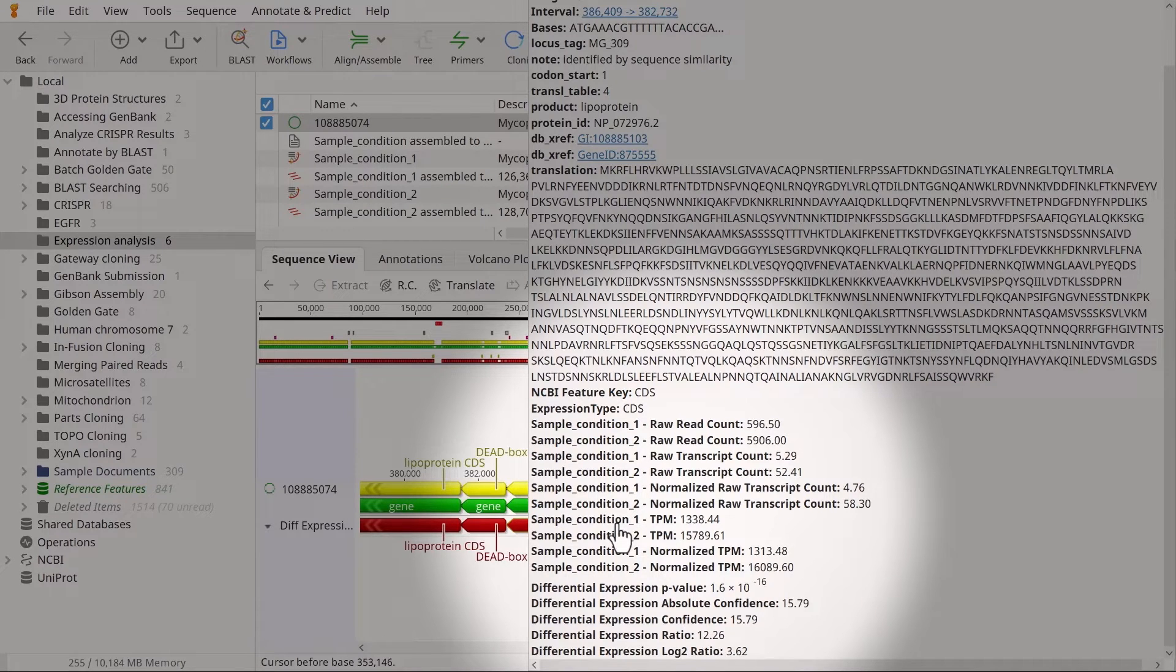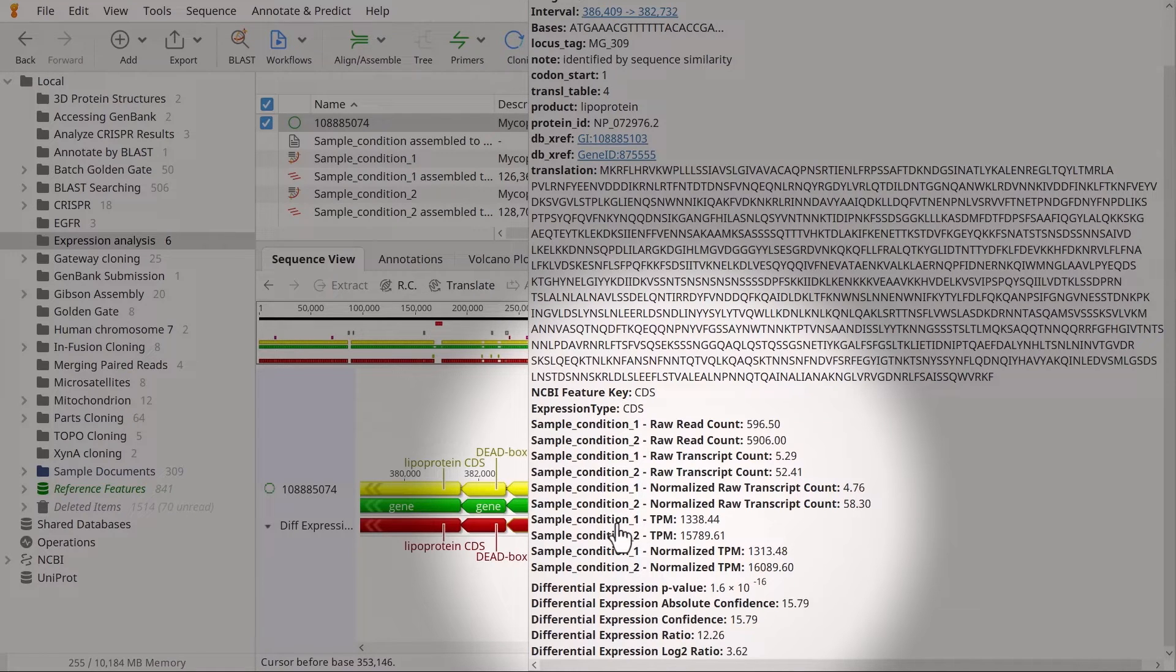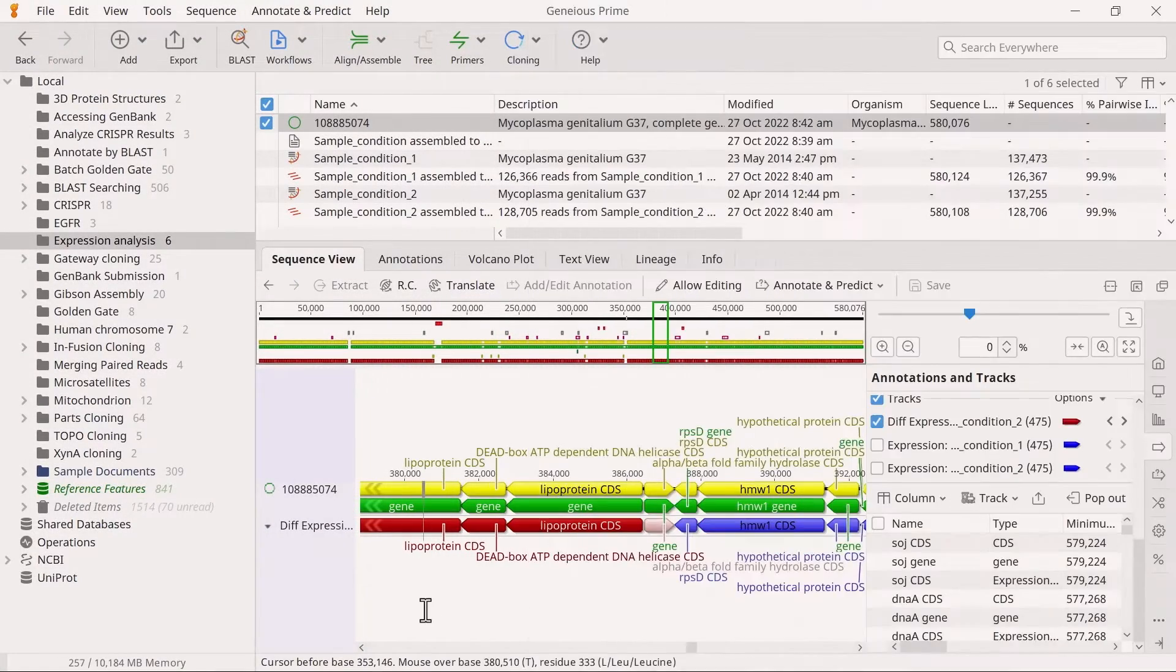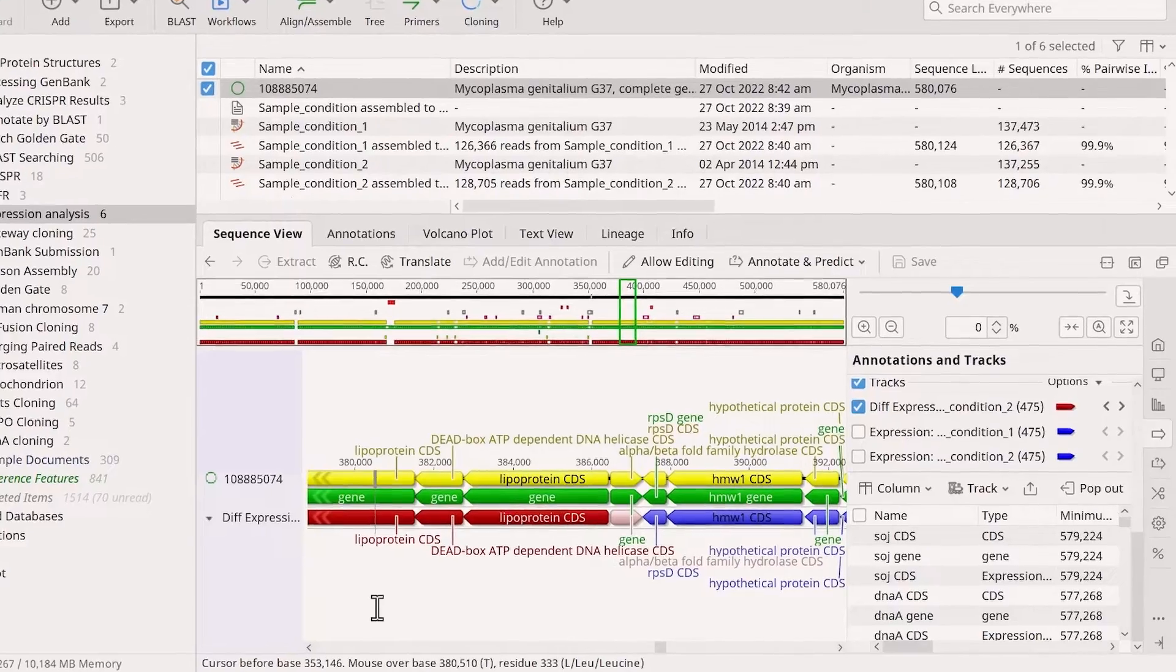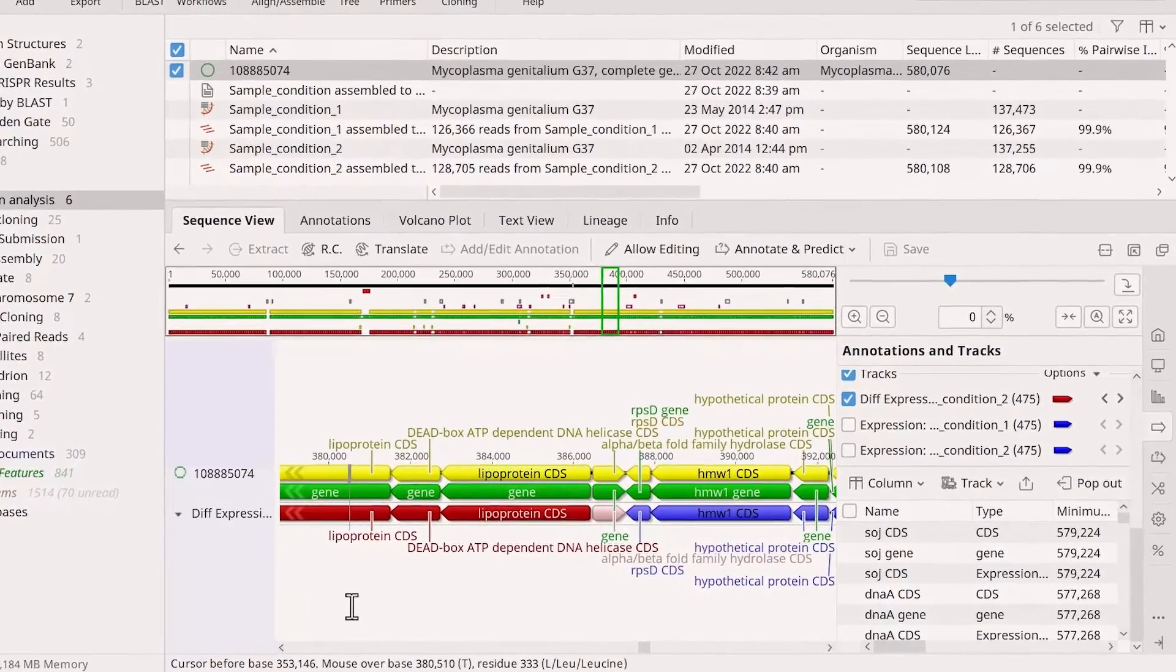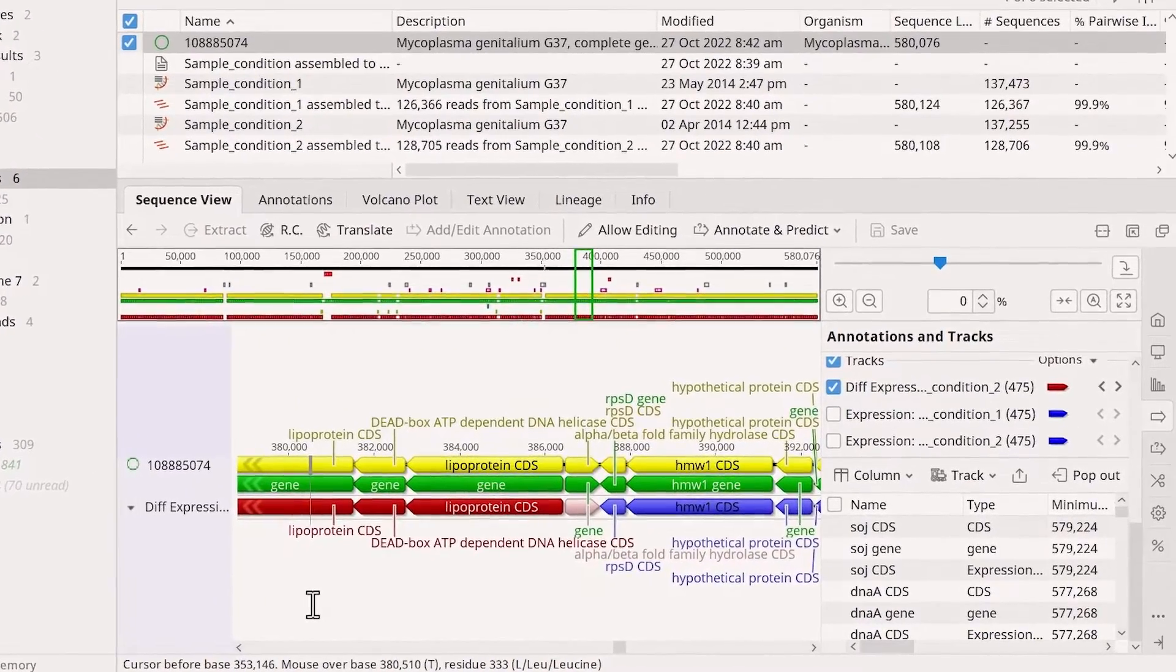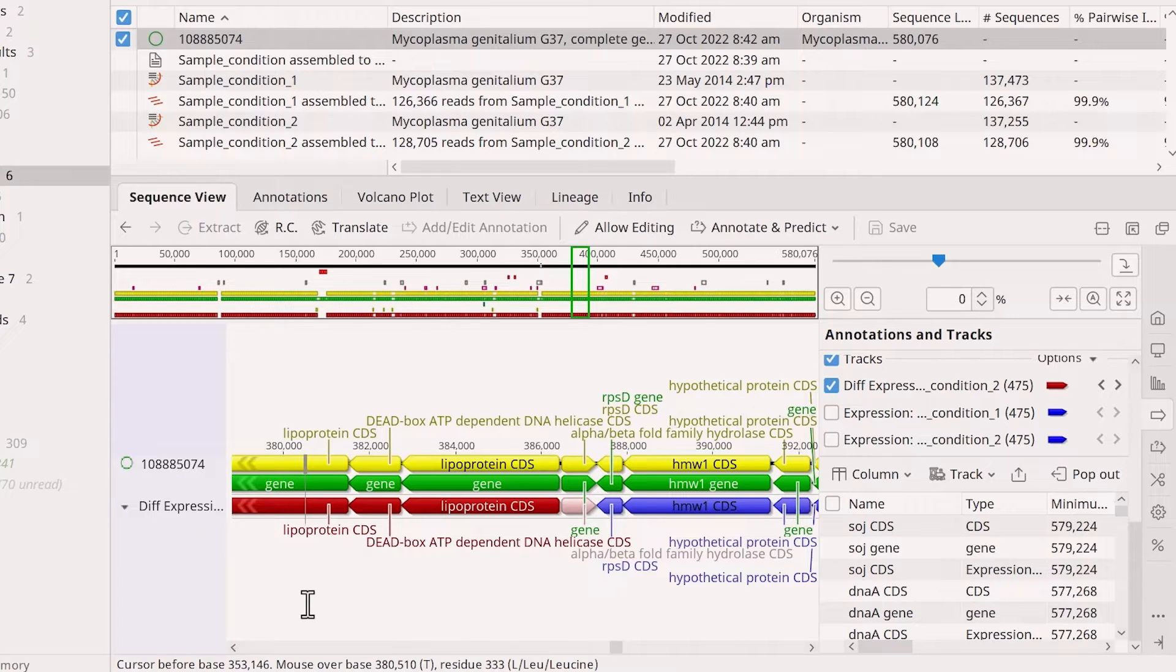The differential expression p-value indicates whether the differential expression observed is statistically significant. The color of the genes on the track displays the differential expression confidence value. Genius uses this value to color the annotations in sample 2 compared to sample 1.